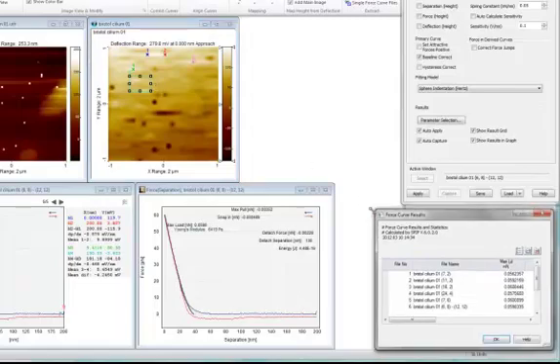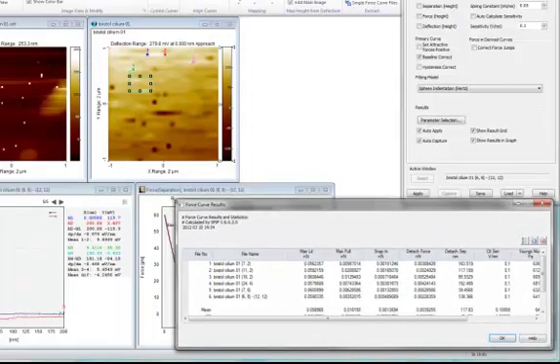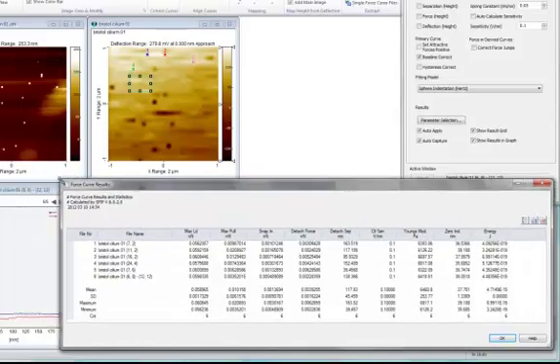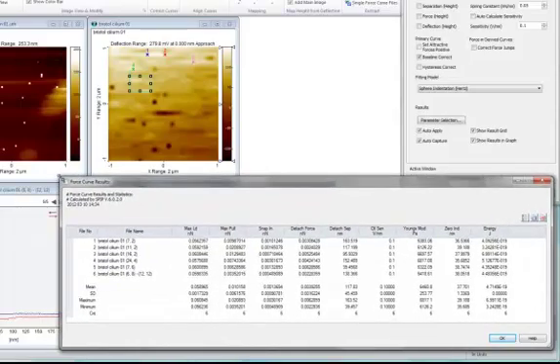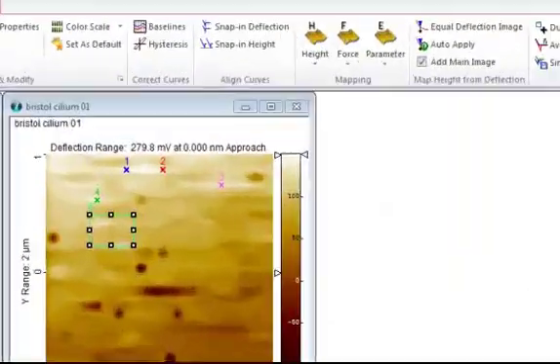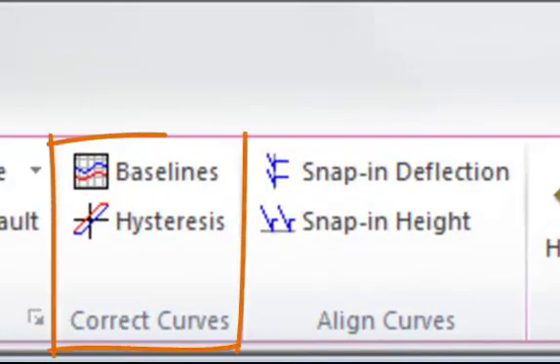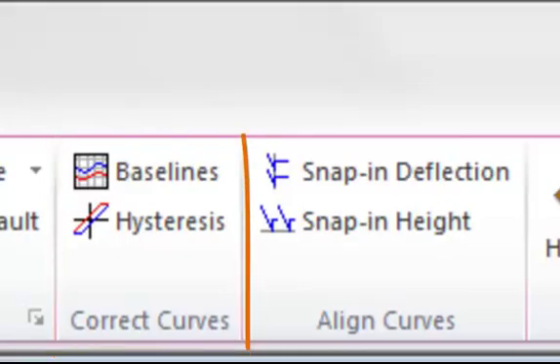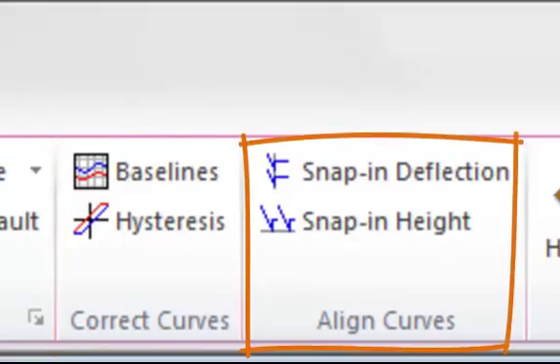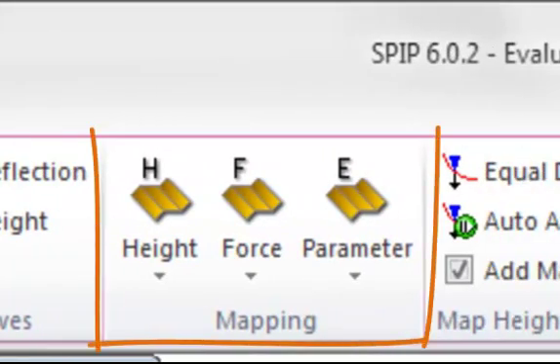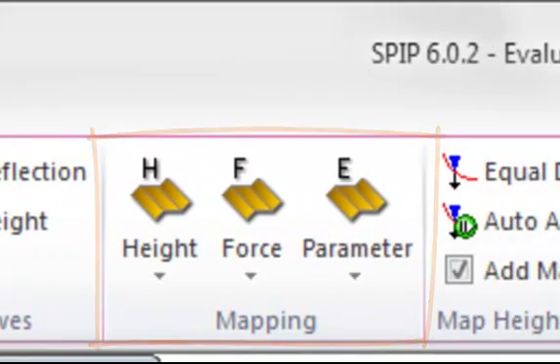are added to the spreadsheet view, which also includes statistics for each parameter. The ribbon offers various tools for correcting the curves in the force volume image and for aligning them. From the ribbon, you can also generate various maps from the force volume image.